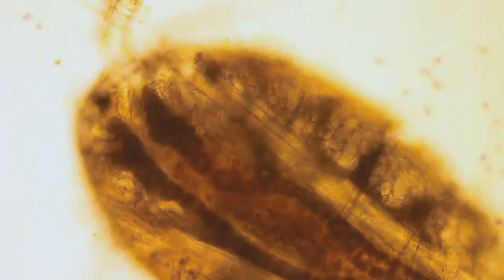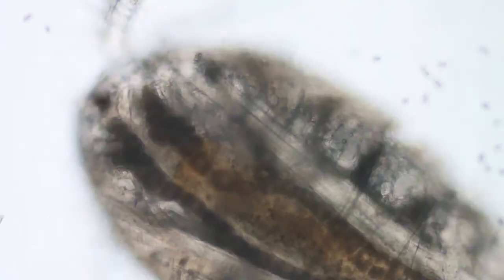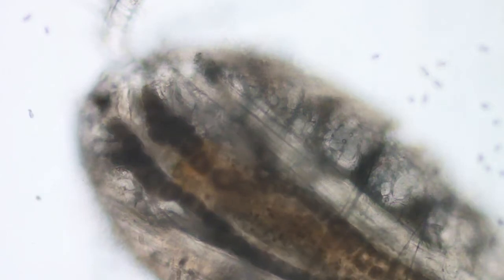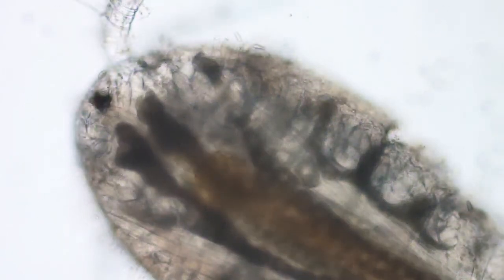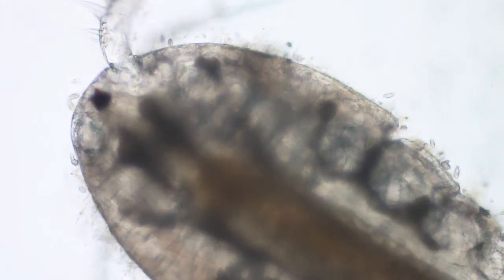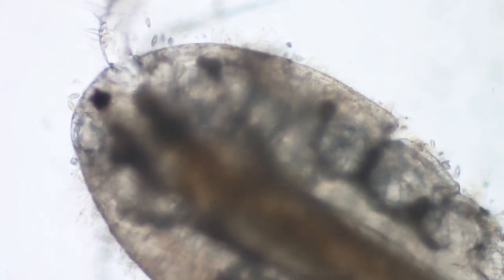I'm going to stop and fix the white balance. Okay, I fixed the white balance. This is looking at this Cyclops again on the adult stage. Looks like about the second or third instar of the adult stage.